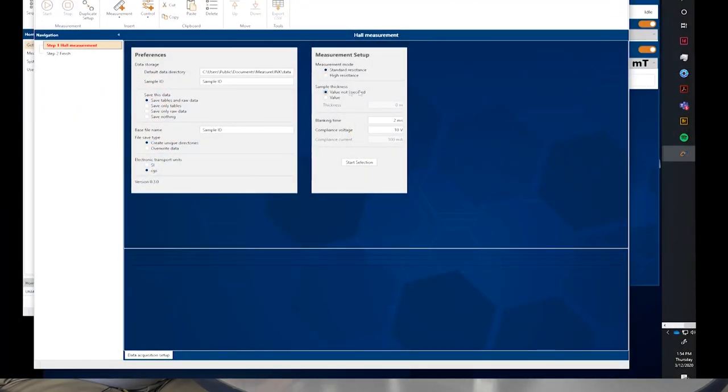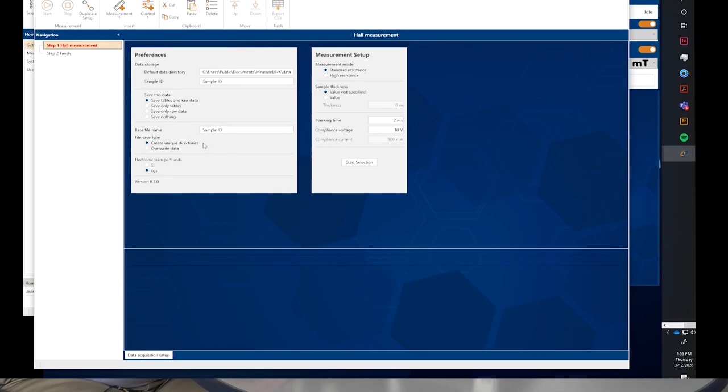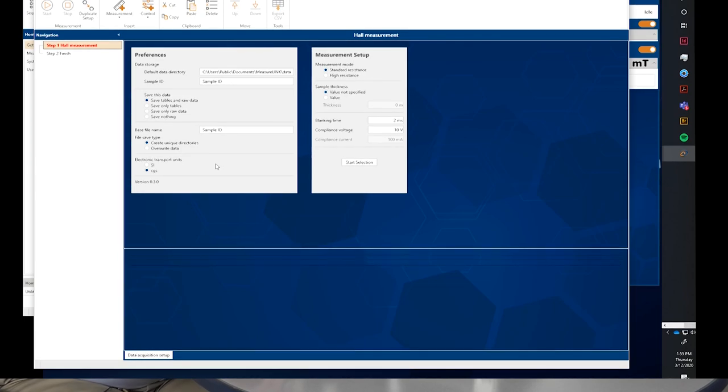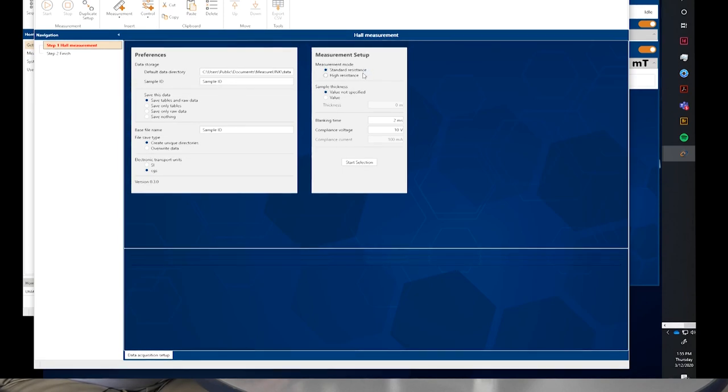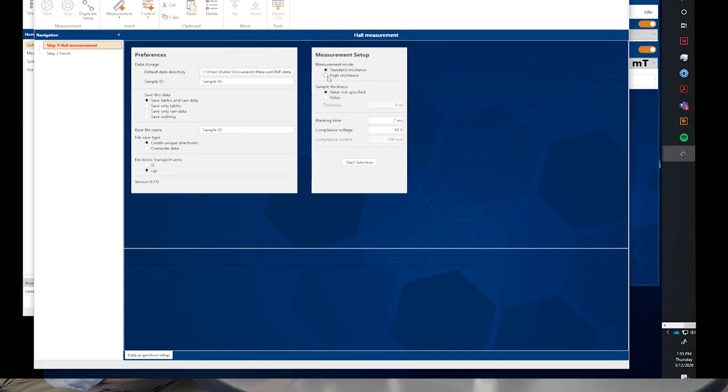So we have these first two windows that come up. I won't go through all of the details. We have basically here where the folders are, where the data folders will be located, and what data that we have to be saved. We can choose here standard international units or CGS. I have it on CGS. So, for this, what we have is a standard resistance or high resistance. That refers to the mode that we're going to operate in. So, for this sample, I'm just going to use the standard resistance and then a blanking time and a compliance voltage.